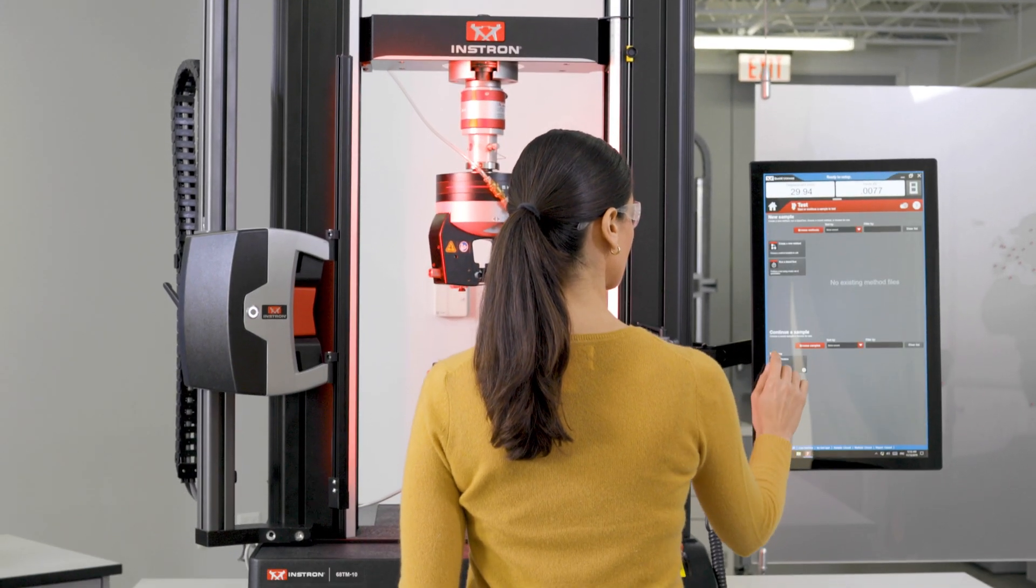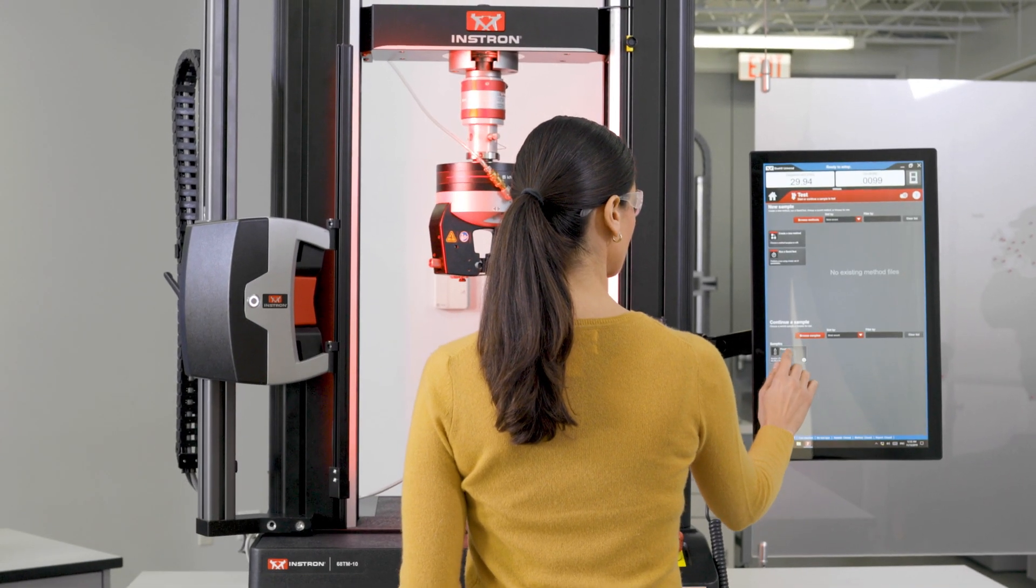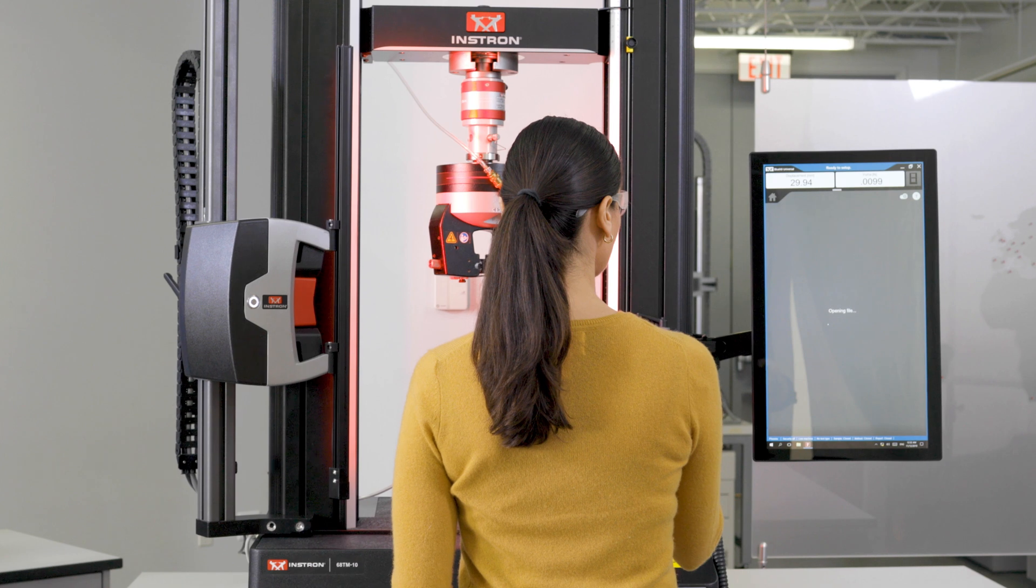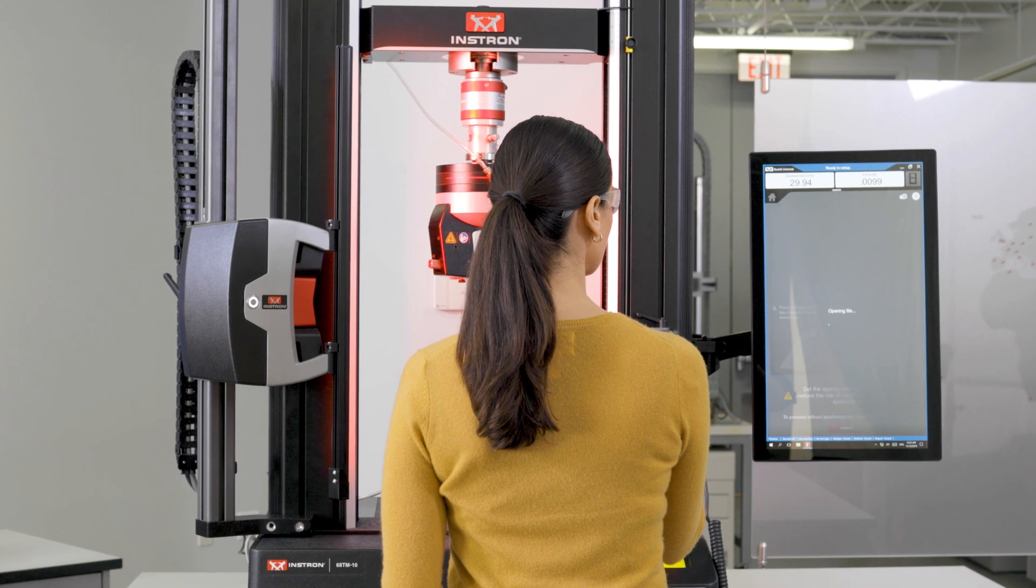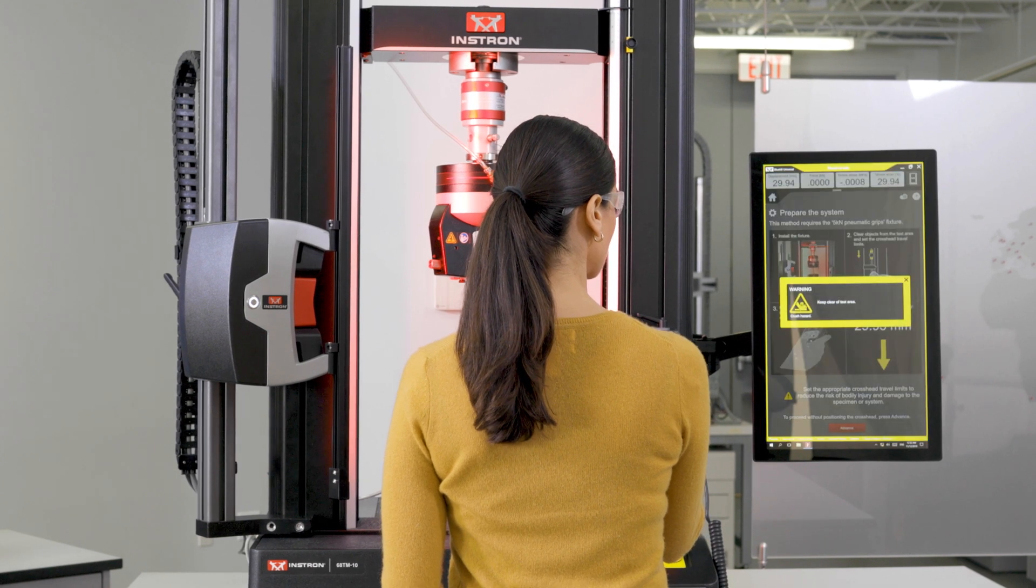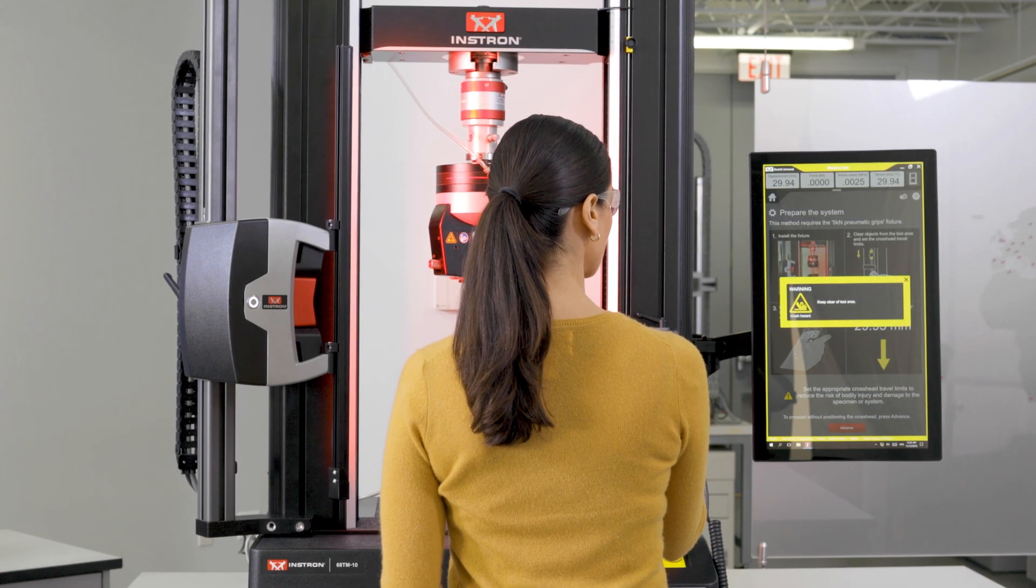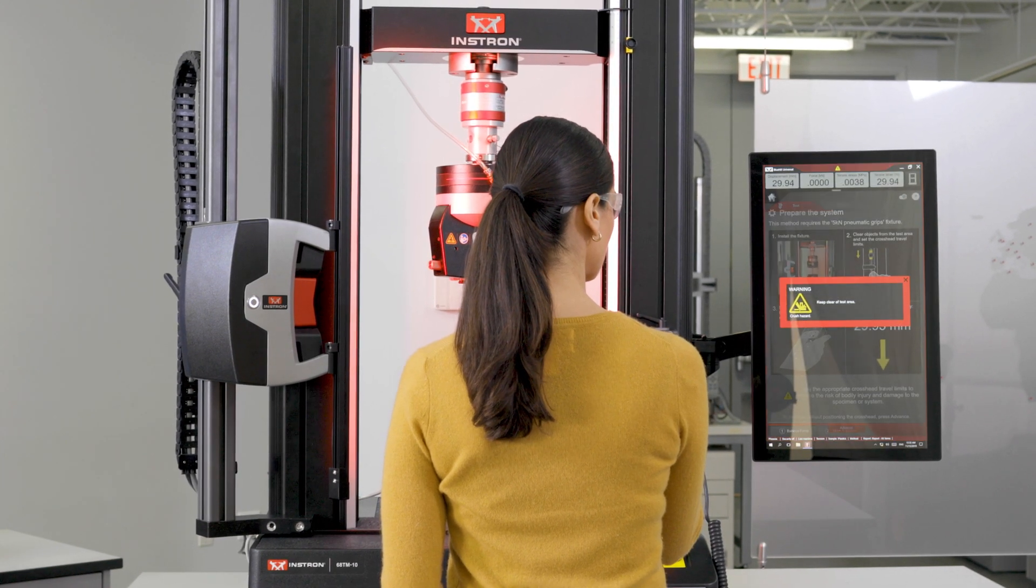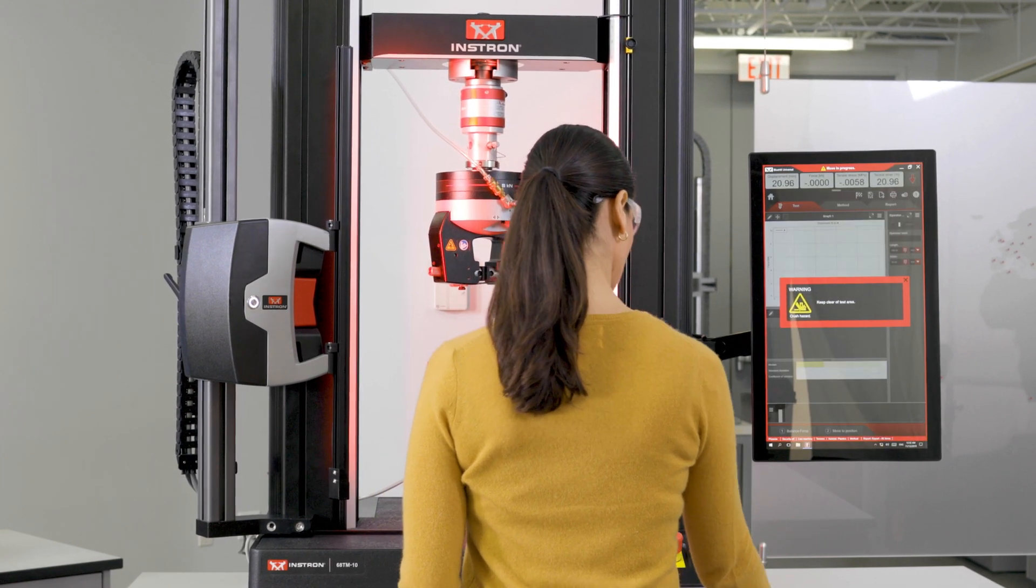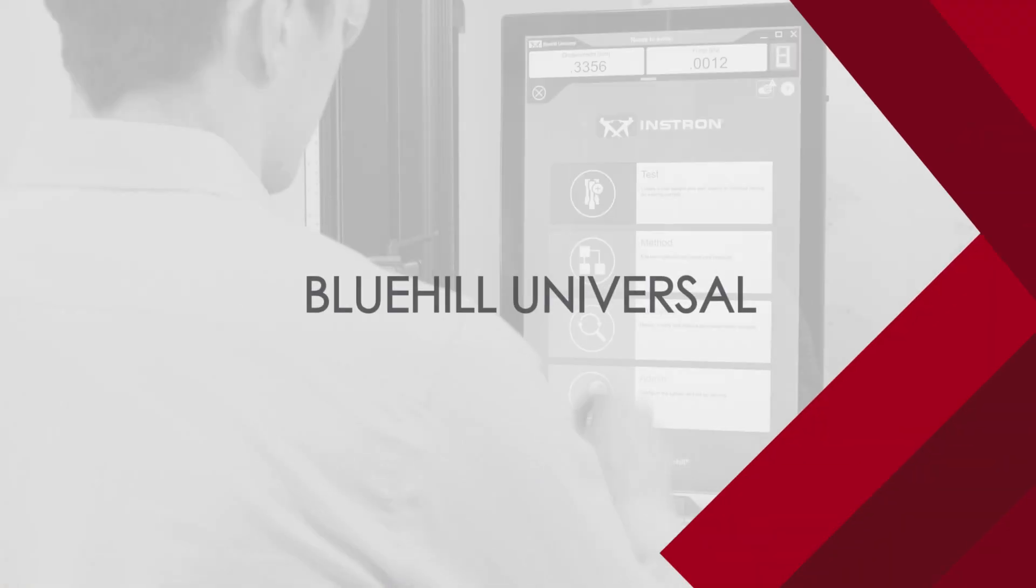Displayed on a side-mounted touch computer, its adjustability and proximity to the test space provide an ergonomic, perfect-fit solution for any lab.